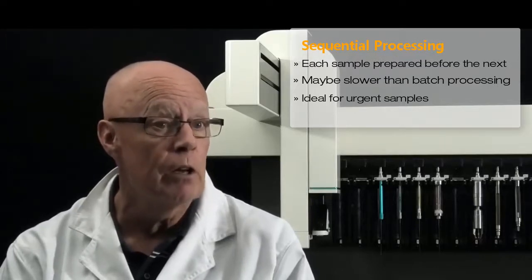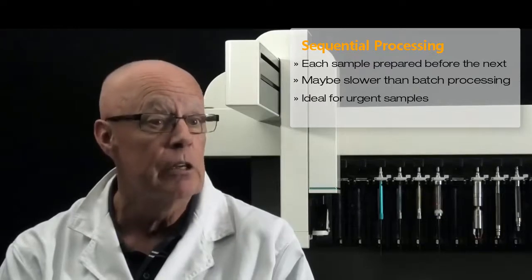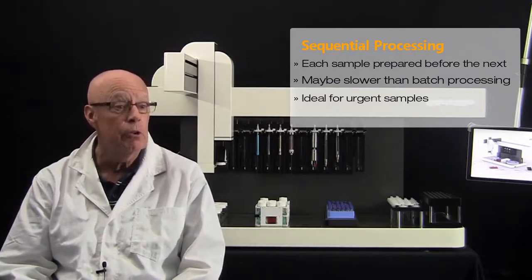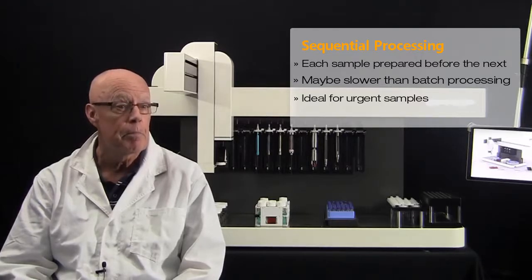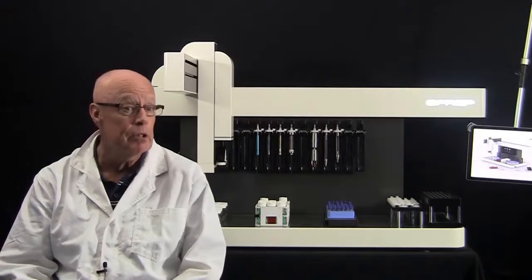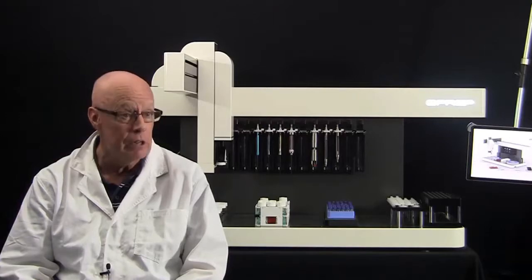So for example, you might have a situation where you need to analyse your samples quickly and get each vial to the autosampler as soon as possible. In this case, sequential work processing would work better because the first sample is prepared completely before going on to the next sample. As soon as the first sample is prepared, it can go straight to the autosampler for analysis. So let us get started and set up a sequential process through the tablet software and see this workflow in action.